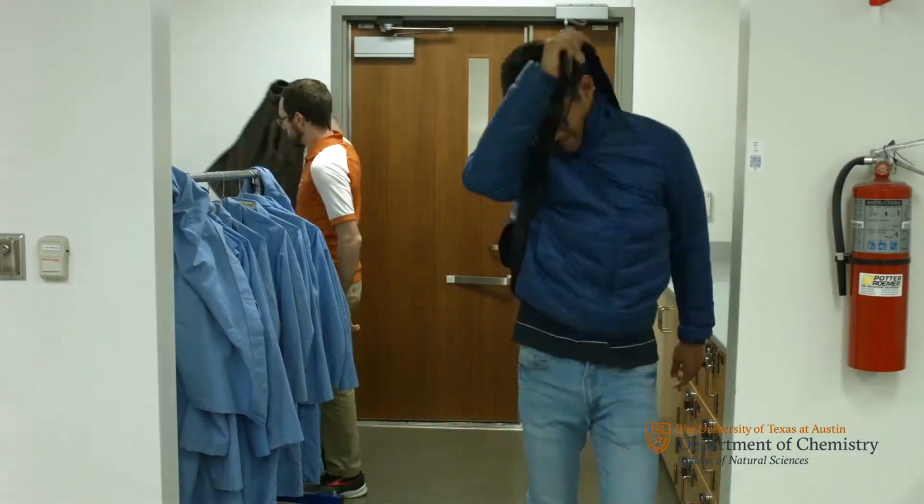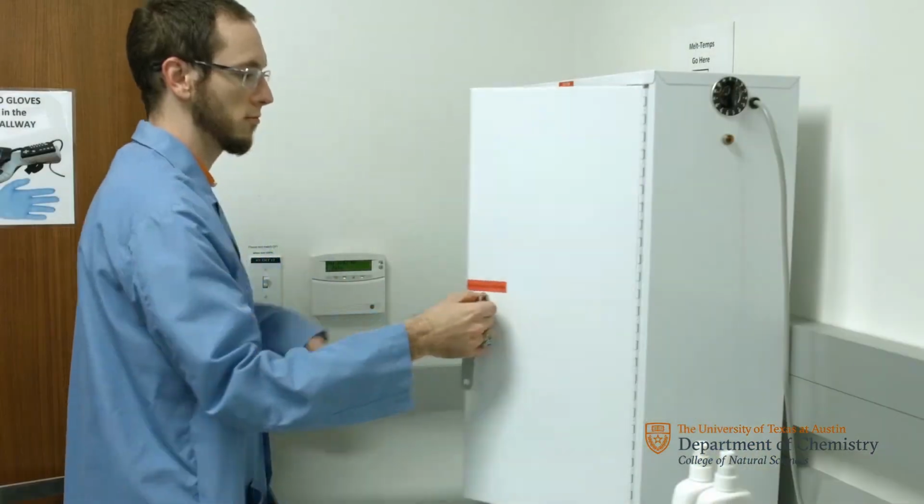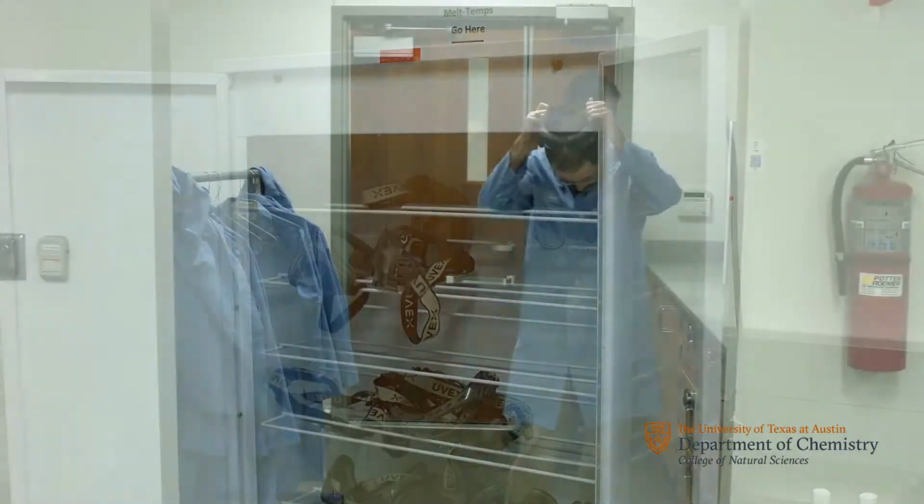When you first enter the lab, please be sure to put your stuff away into a cubby and then put on your lab coat and goggles.